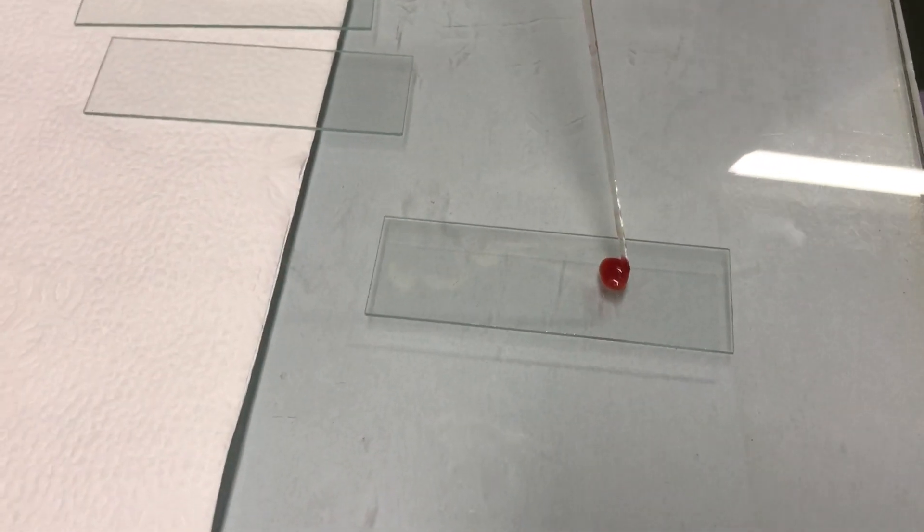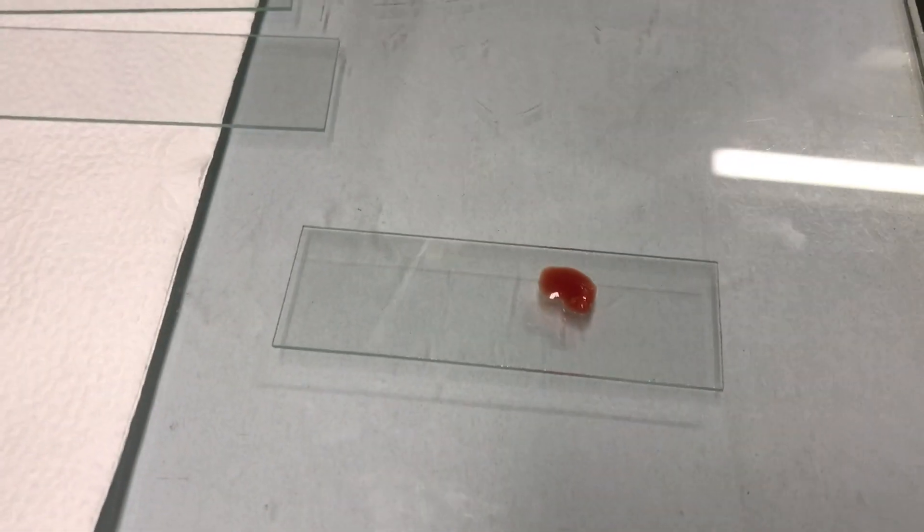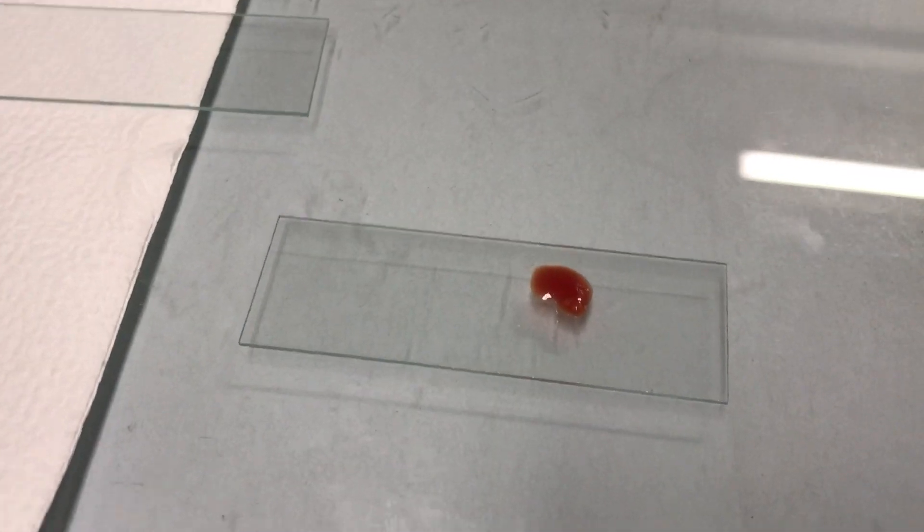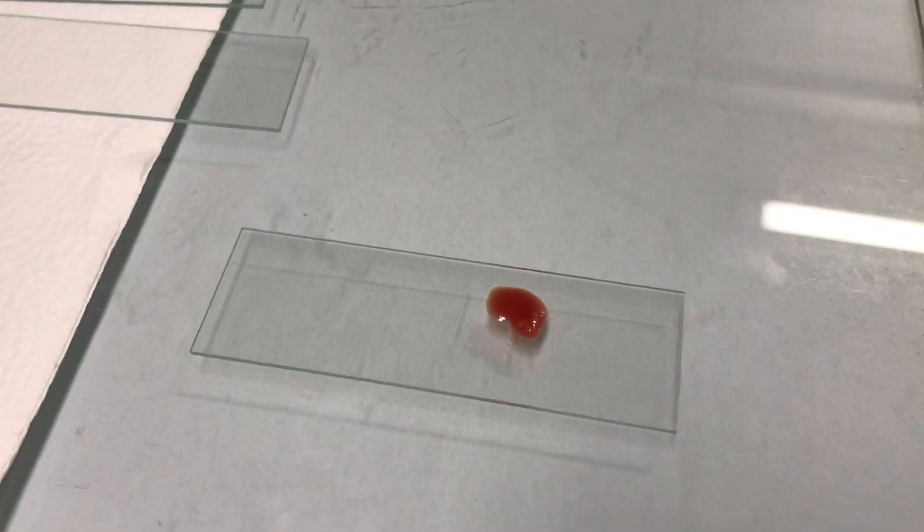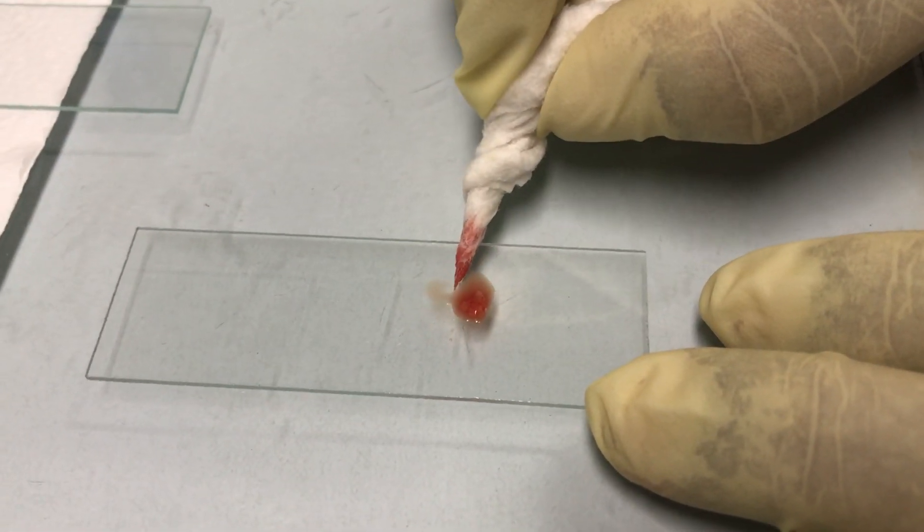Now the glass slide contains the marrow particle as well as the blood present in the bone marrow. Now we have to remove the blood by using water-soaked cotton.